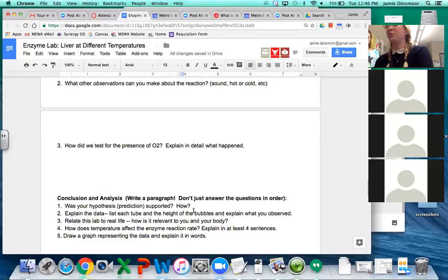All right, sorry for people at home. You're probably like, can't see it as well, and you're just like, but it's cool in person, I promise. Don't try this at home, kids. You could do this experiment at home. Adult supervision. Yeah. I'm sure your parents will be concerned if you say, buy me some chicken livers.